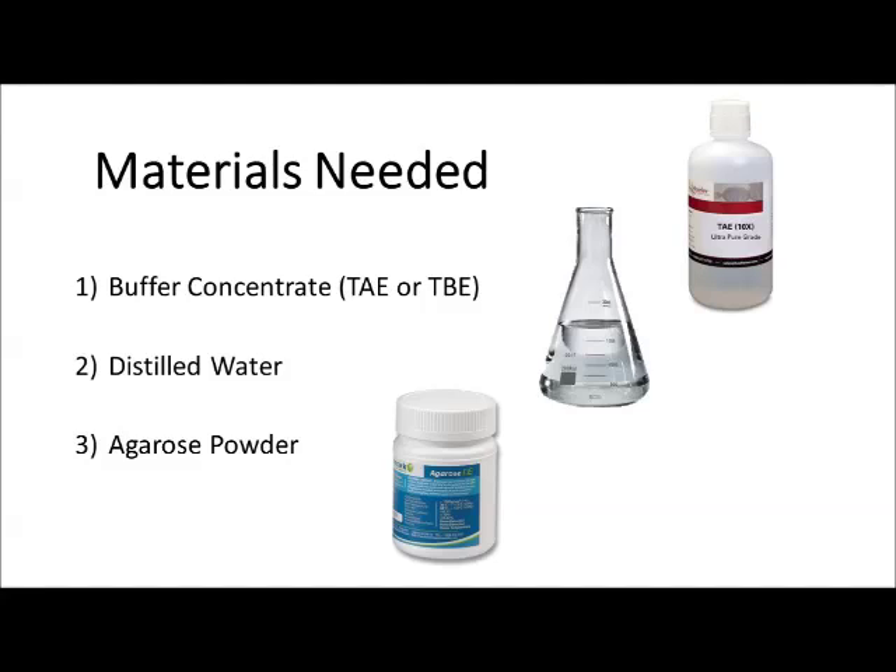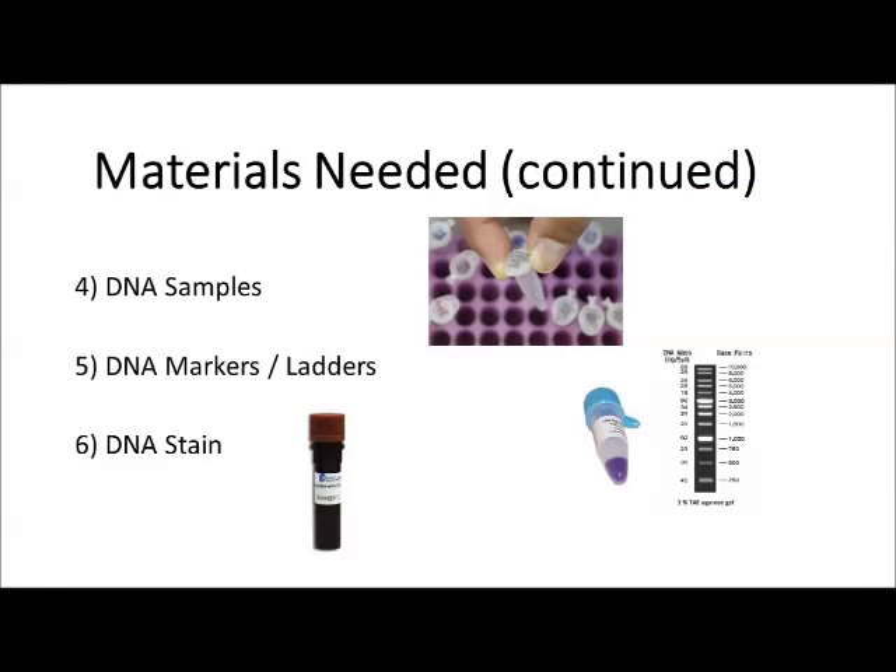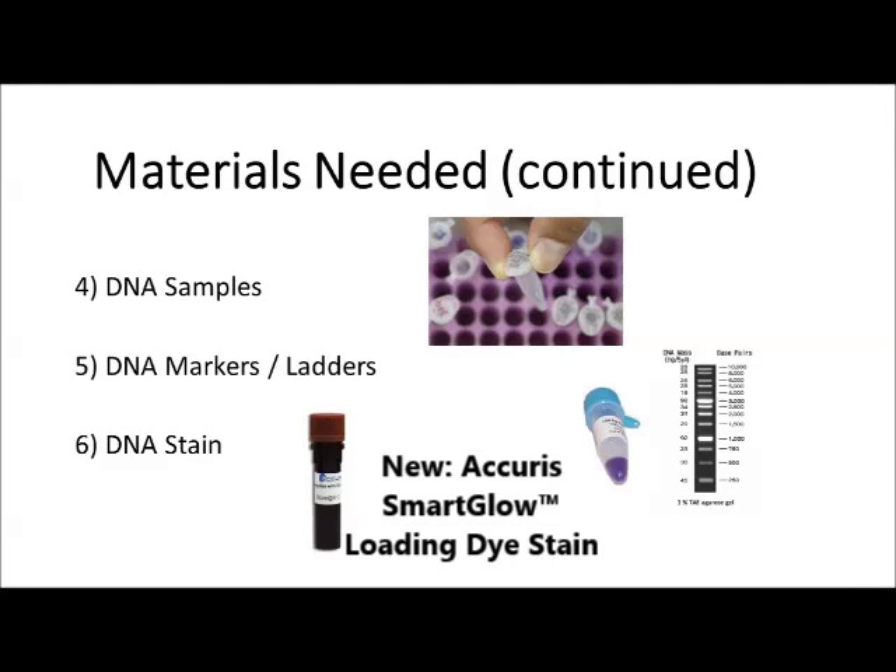Materials needed include buffer concentrate, either TAE or TBE, distilled water, and agarose powder. Also needed will be DNA samples and DNA markers or ladders. For our demonstration we'll only be separating DNA markers on our gel, and we'll also need some DNA stain so the DNA can be visualized once separated on the agarose gel.